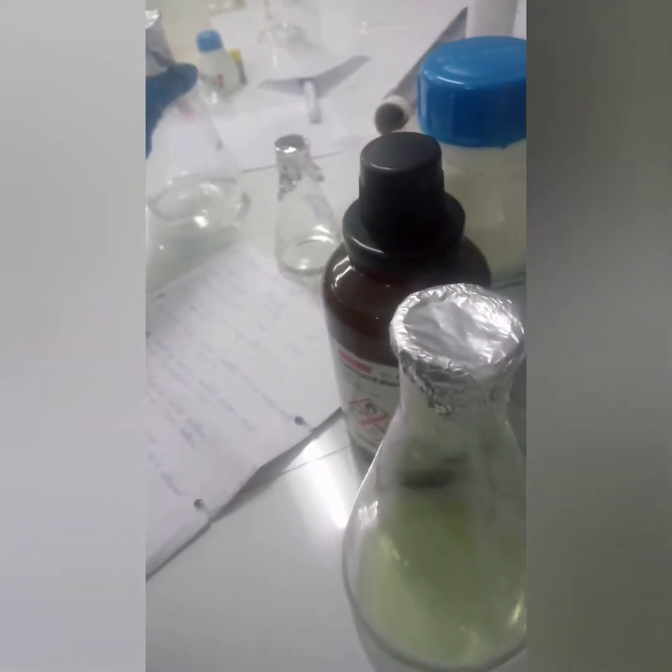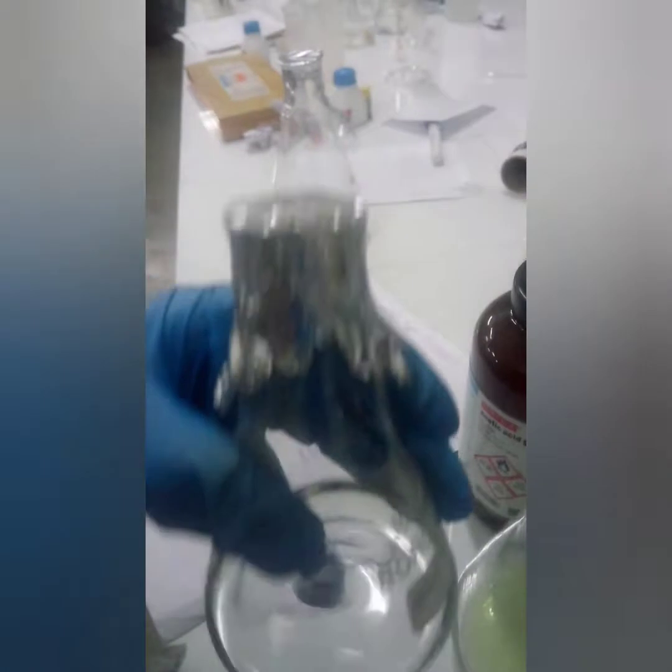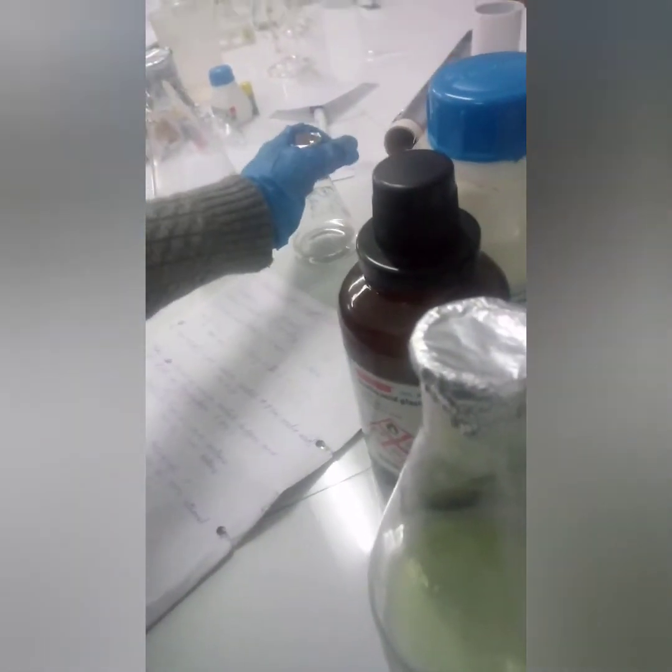The last reagent that we require here is the standard amino acid. This standard amino acid I have also already prepared. Its strength is 200 microgram per ml.